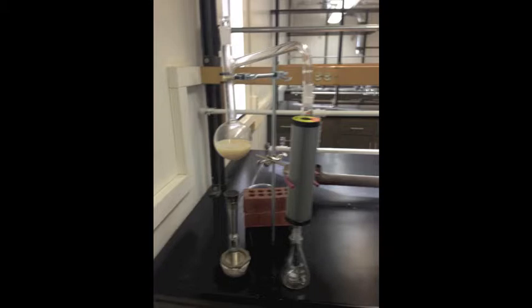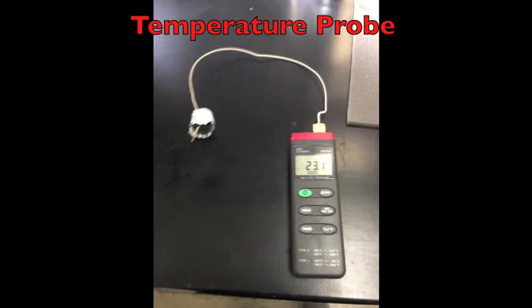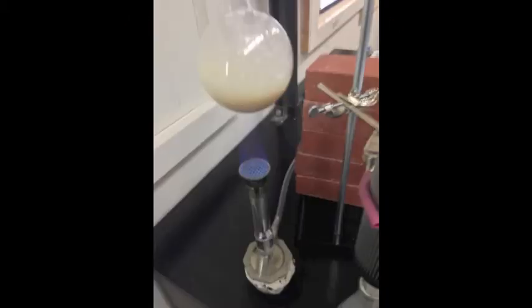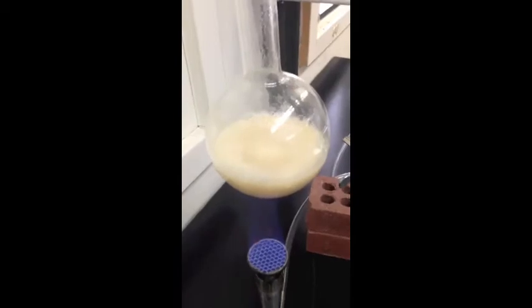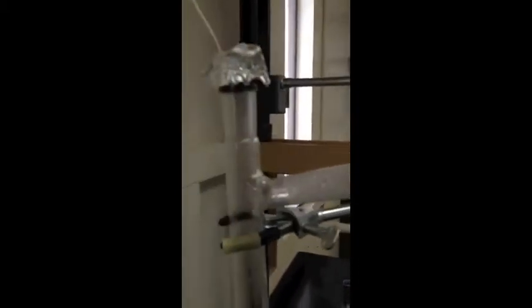Now that the chamber is ready, remove the glass cap that is covering the distillation flask and insert the temperature probe. Next, carefully heat the heating source and place it beneath the pot. Soon, the ethanol solution shall begin to boil. While it is boiling, the temperature shall steadily rise until it reaches approximately 79 degrees Celsius. At this point, the temperature will remain constant for a period of time.